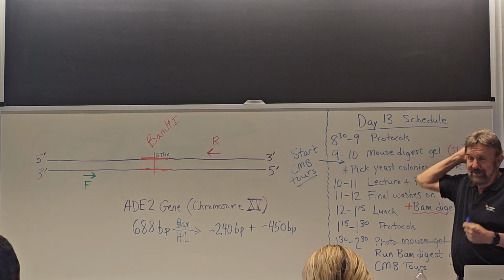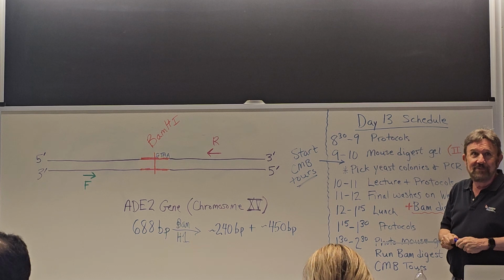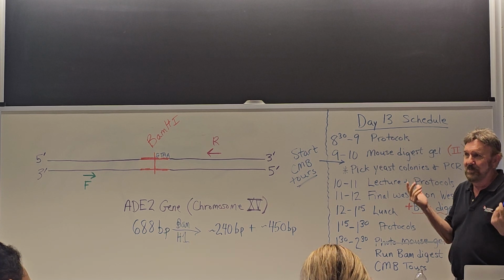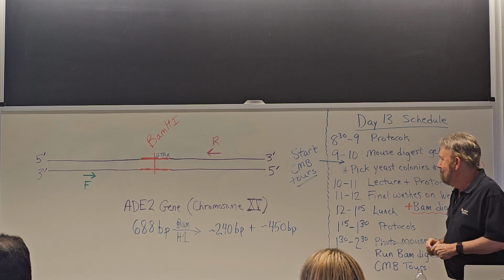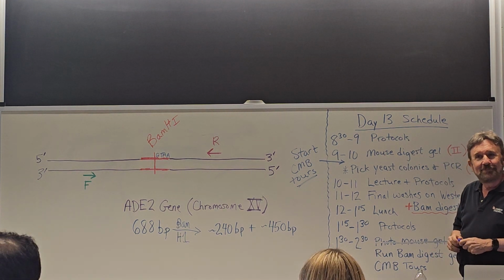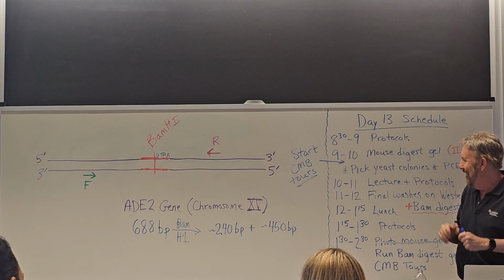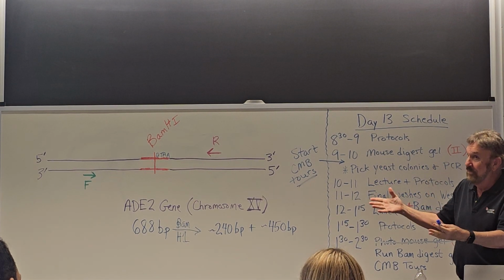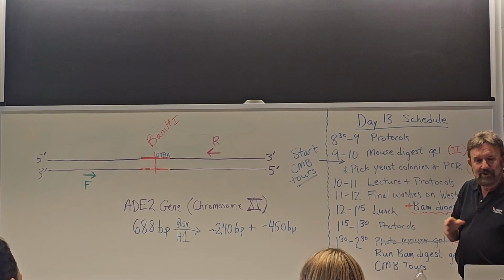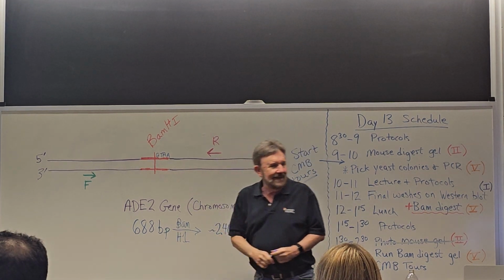Obviously we're not going to have a chance to resequence those, and it's probably just as well, because we haven't solved the problem, and so we could resequence them and probably end up in the same situation until we figure this out. It's really embarrassing. The high school group that's here did their sequences and theirs worked. I mean, it's a reagent issue. They're using different reagents, different columns. They're sequencing reagents with a PCR product. We expect the BAM site in there.